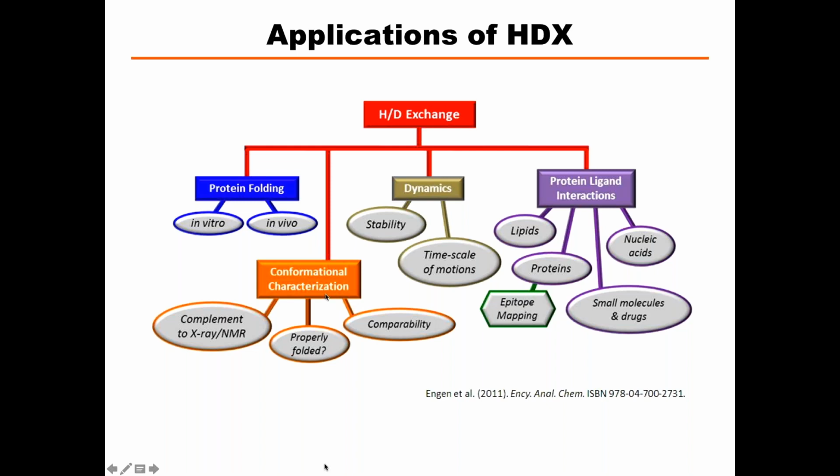In terms of the conformational characterization, a lot of this has to do with comparing whether two proteins are exactly the same when they're produced. So the biopharmaceutical industry is using HDX now quite a bit to show, when they produce two batches of an antibody, that their higher order structure is actually the same in solution, in the formulation solution. In fact, the last 3 postdocs from my lab were hired by Genentech, Amgen, and Pfizer, and they're all doing this for their job.